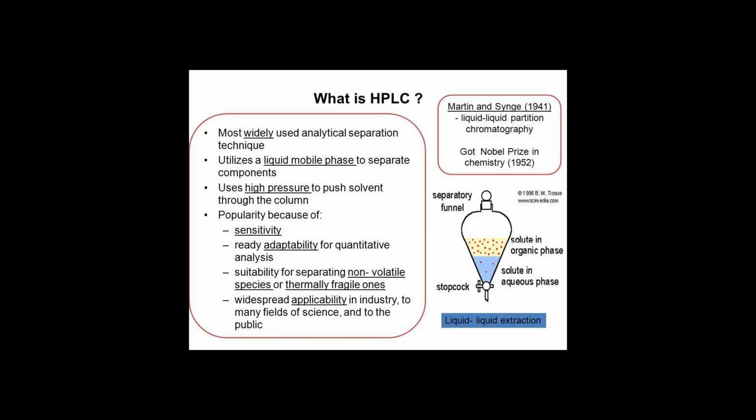Retention factor, kappa prime, measures how long a component of the mixture stuck to the column, measured by the area under the curve of its peak in a chromatogram. Since HPLC chromatograms are a function of time, each chromatogram peak will have its own retention factor, e.g., kappa 1 for the retention factor of the first peak. This factor may be corrected for by the void volume of the column.